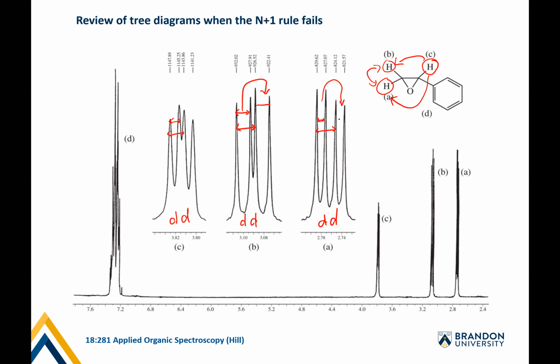So this would be the same over here. If you're ever given a spectra and you're trying to figure out what might be coupled to what, there's a neat trick you can do, and that is just grab a little piece of paper and put the edge of the paper right at the two peaks and draw on the piece of paper. Then move that piece of paper somewhere else on the page, and you'll see, oh, that peak there and that peak there have got the same width. So I know that this is coupled to that.